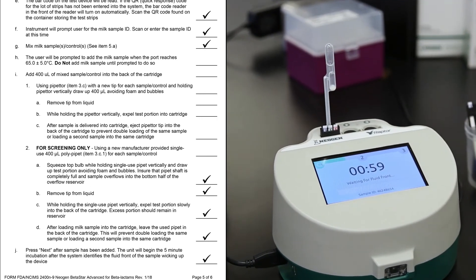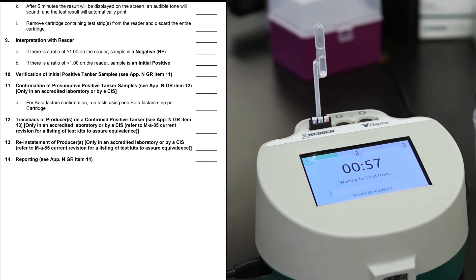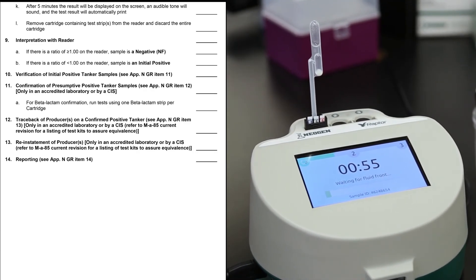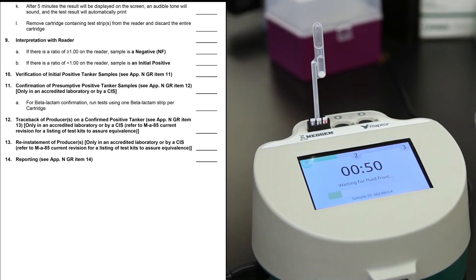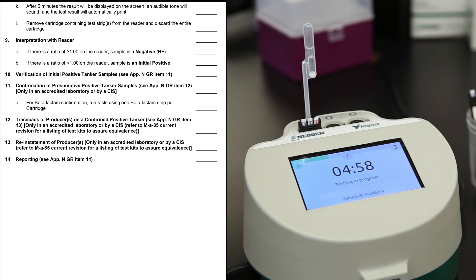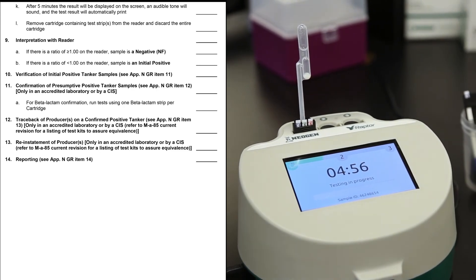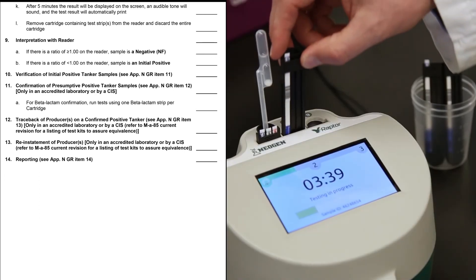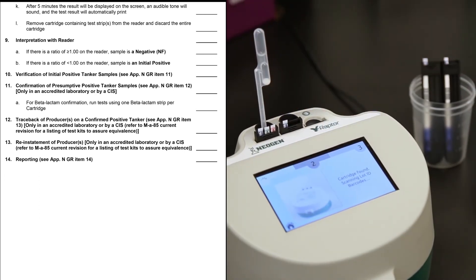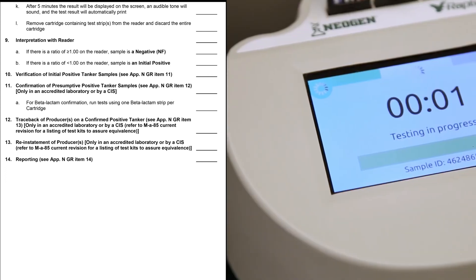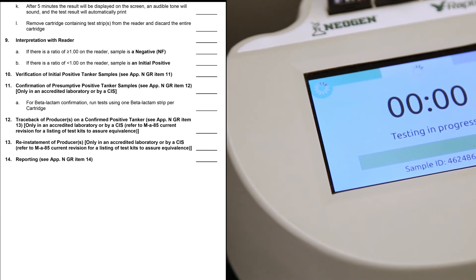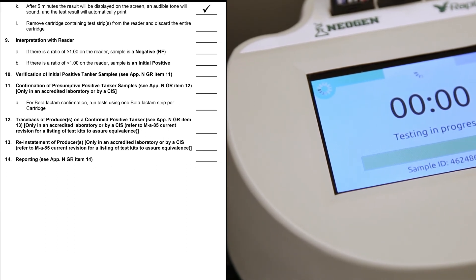Press Next to continue. The countdown begins while the camera is constantly looking for the sample fluid front. When the sample fluid front reaches the test strip membrane, the 5-minute timer starts. This ensures the 5-minute incubation is the same for everyone running the test. Since all three ports operate independently, you can move on to the next sample when the first sample is in process. After the 5-minute incubation period, the result displays on the screen and prints automatically.